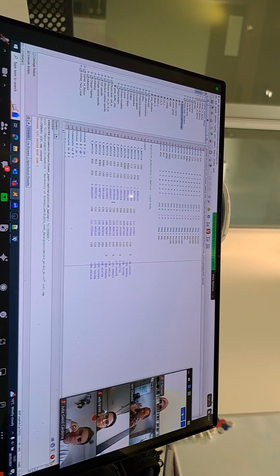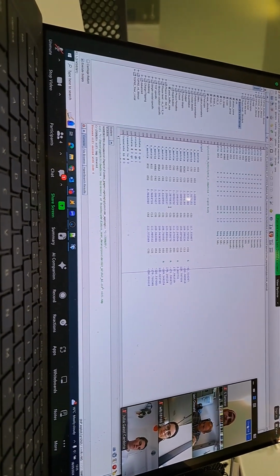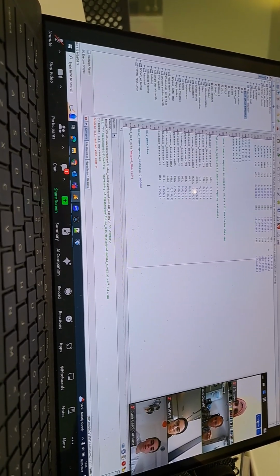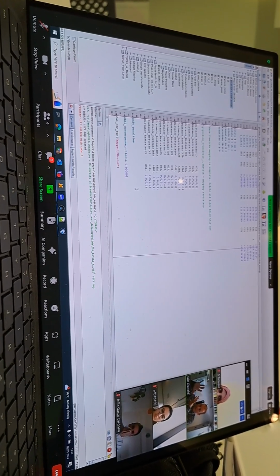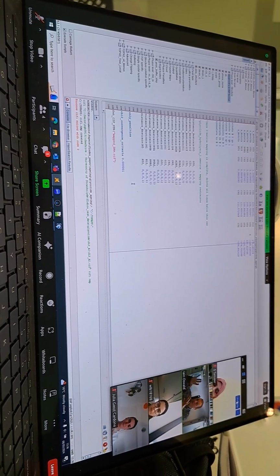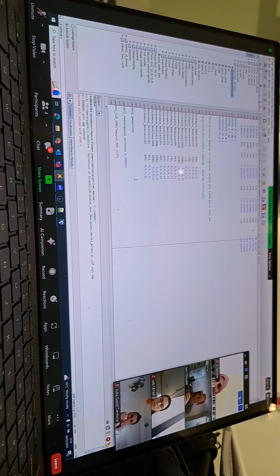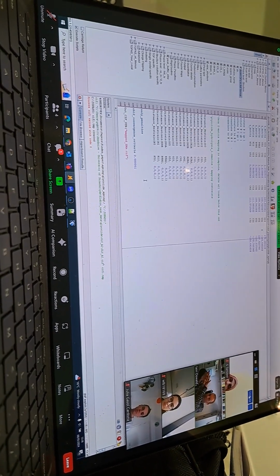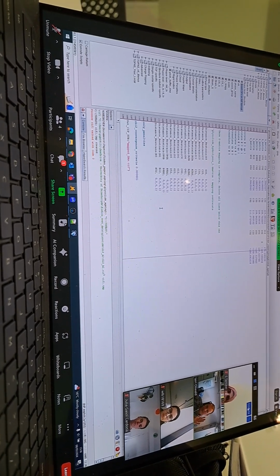So that's that. As soon as you press go, that will turn into a molecule. The second instantaneous thing that's going to happen is that the instructions down here are going to kick in. So you've got one crystal structure, you've got the second one that's springing into action, okay? And then this one here is going to go, all right, distance restraint, you've got to be here, all right, okay, there. And then they will map onto the other crystal structure. So you're going to have one springs into a molecule and then maps onto the next one, okay? And we'll see how well that goes in an instant.